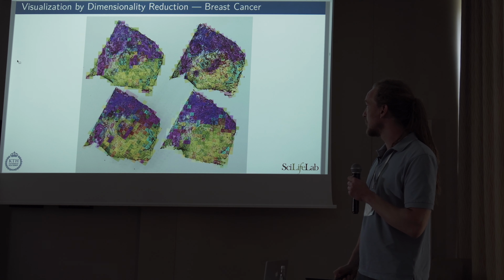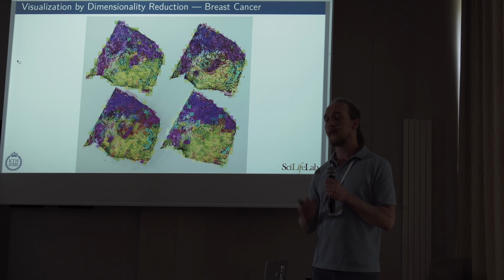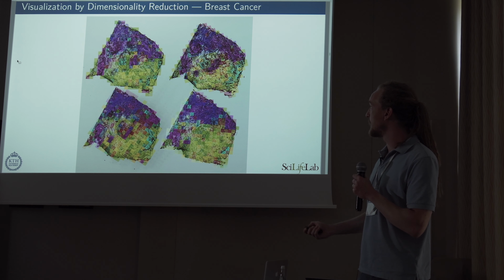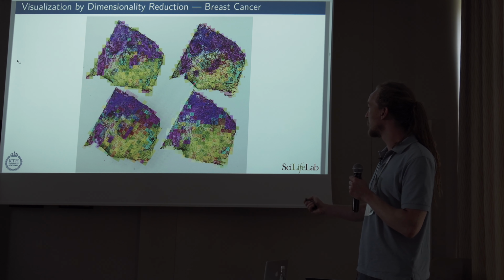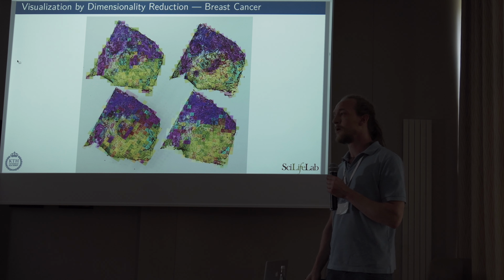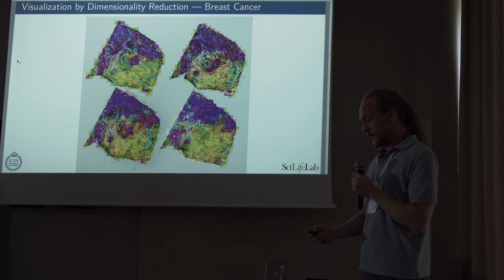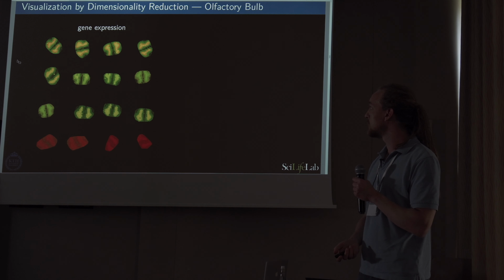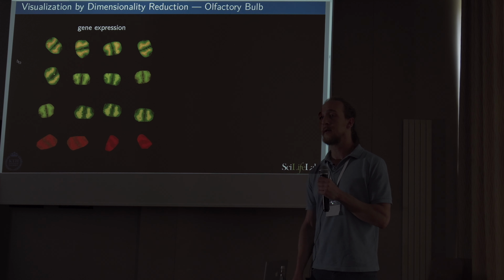I do want to go on to note that if you have several sections from one experiment, this can still work rather well. There are interesting things to be seen here, like this tumor focus in the center not being present in the 4th section anymore, as it should. If you do go on to look at more, yes.